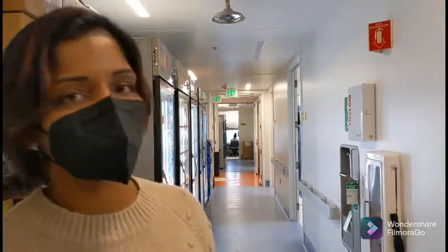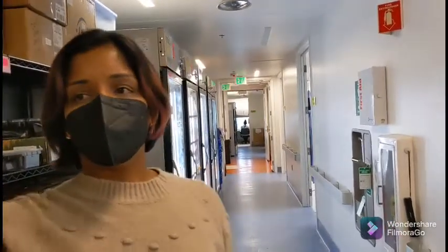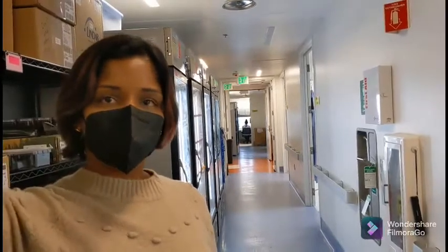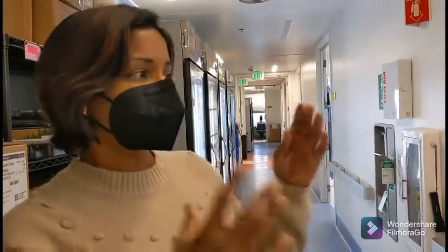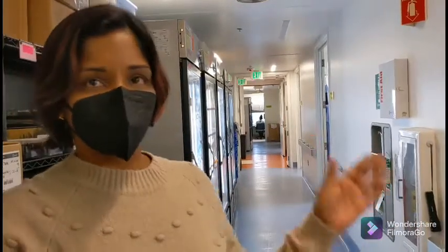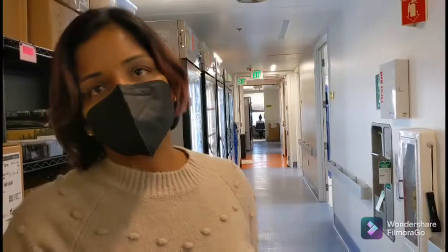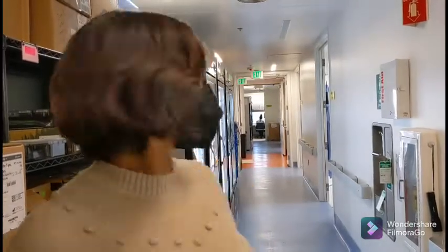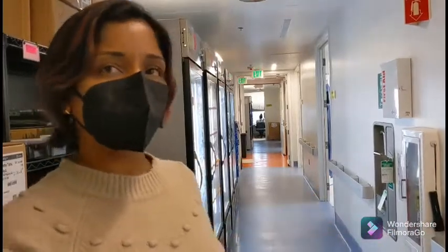So that's this here. Is that also part of what's happening in the other room we just saw? At the very end, so the room that you just saw is specimen intake. After they come in, they get batched together and they get run on one of the different platforms, depending on what's the sort of workflow that day or throughput that day. And so this is one of them, and there are many rooms like this here. Excellent. Let's take a look.